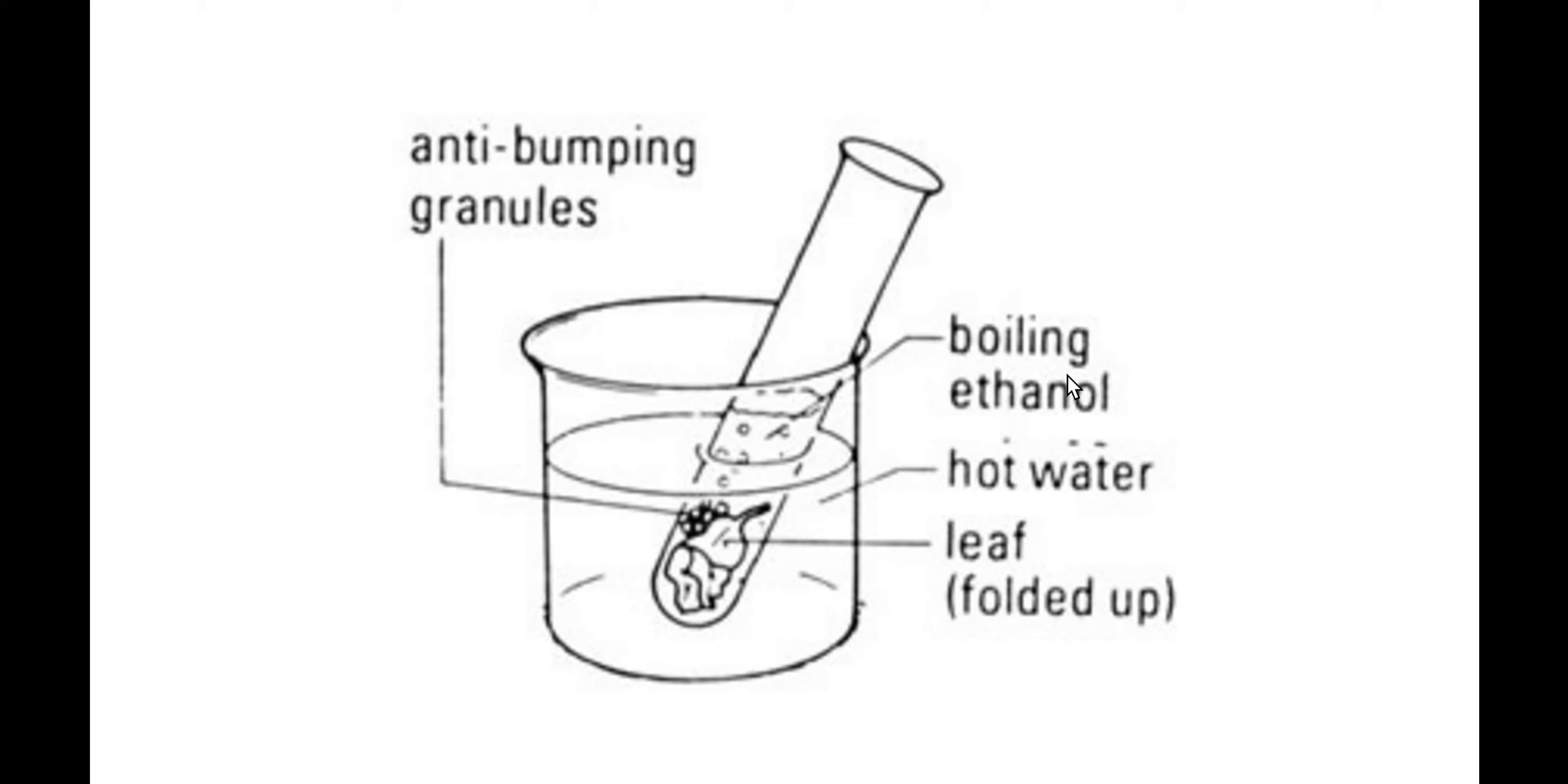That test tube will sit in a beaker of hot water which will act as a water bath to heat the ethanol up, and that will continue to remove the chlorophyll from the leaf. What will happen is we'll see the methylated spirits turn a green color and the leaf will end up looking quite bleached.